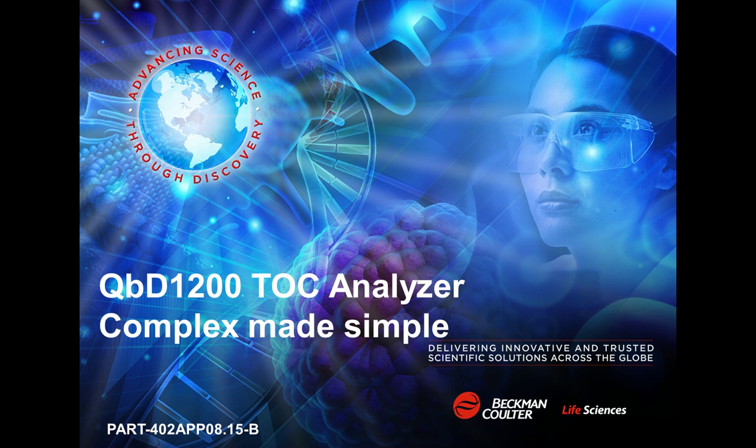Our first question is, why is it important to validate a TOC analyzer to ICH-Q2? Certainly. Most validation packages that you get with off-the-shelf instrumentation validate that the machine works correctly and does what it's supposed to do.